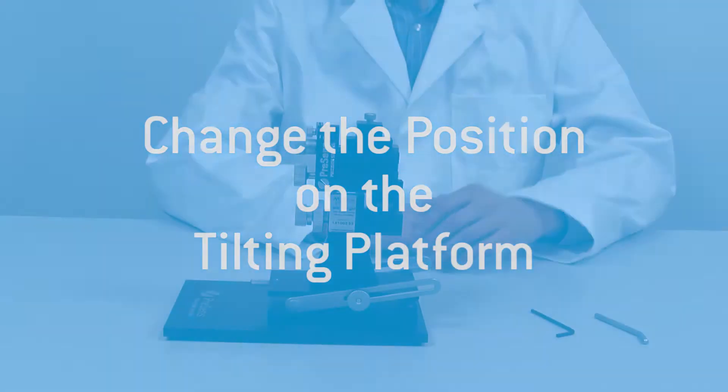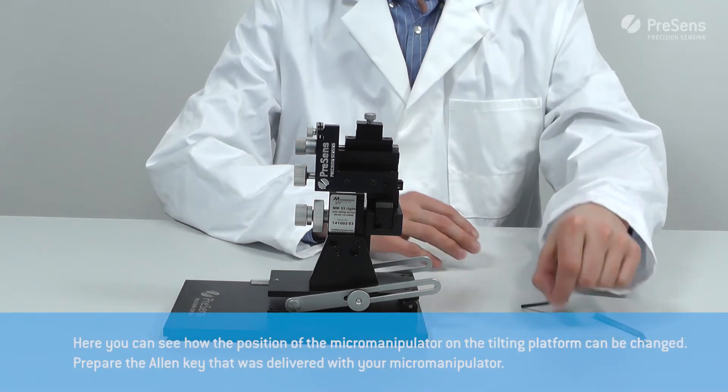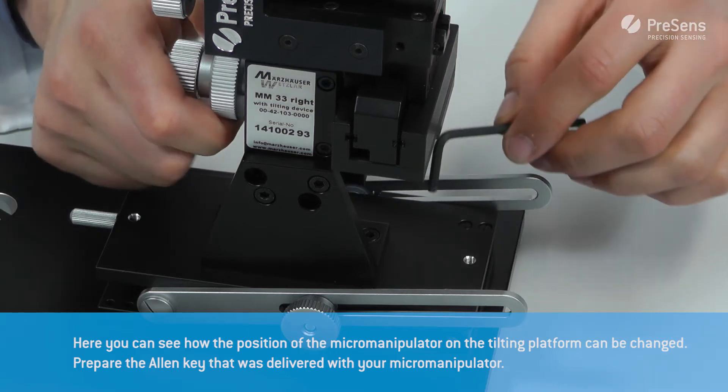In this video we show how the manual micromanipulator can be adjusted to your measurement setup. We start with changing the position of the micromanipulator on the tilting platform.